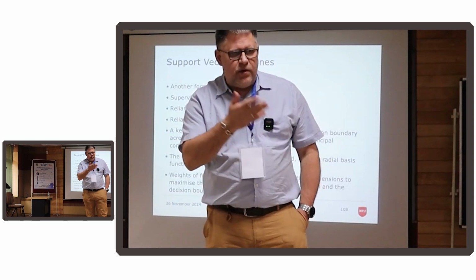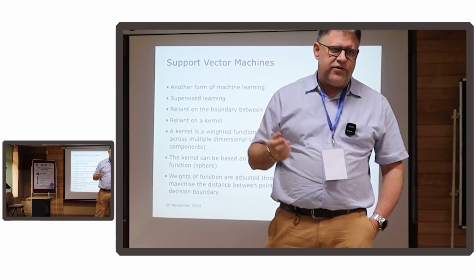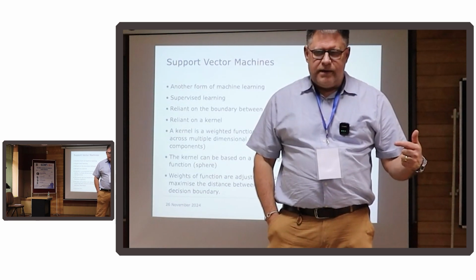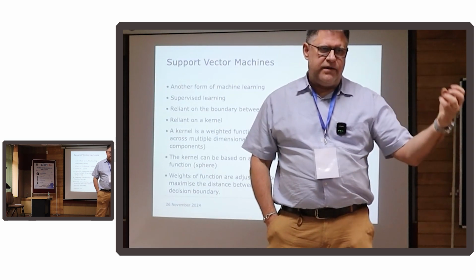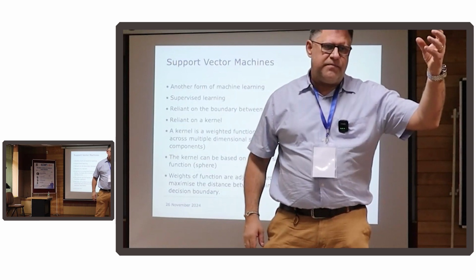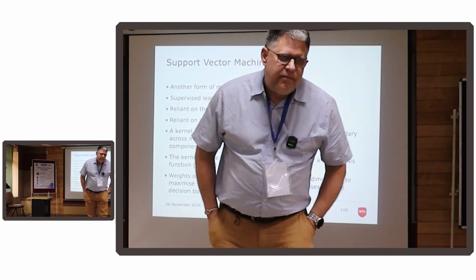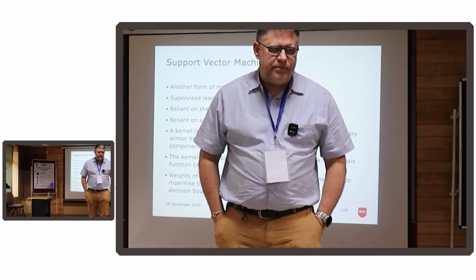What we can also do though is we can start building models in a stepwise fashion. So we could say, what's the best single variable? We find the best single variable, we keep that. We then add remaining variables to that to find the best pair of variables. By selecting variables which are significant according to our data, we can add them into our model.